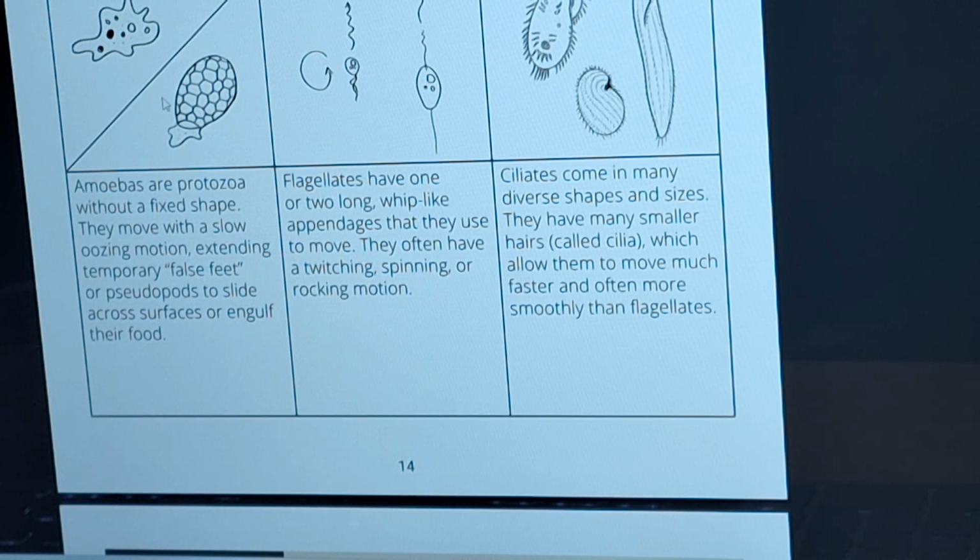In the amoeba, there's 2 types. There's a shelled amoeba. It's called a testate amoeba. The test is the shell around it. And then the non-shelled amoeba, a naked amoeba. They're a little harder to see. They blend in real well. And then hopefully we'll see flagellates.